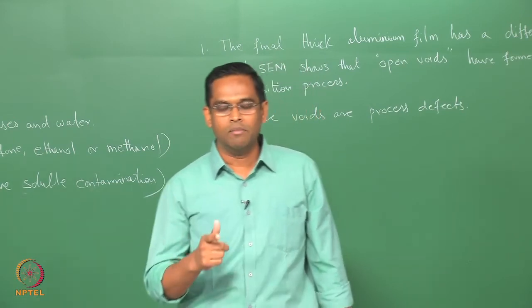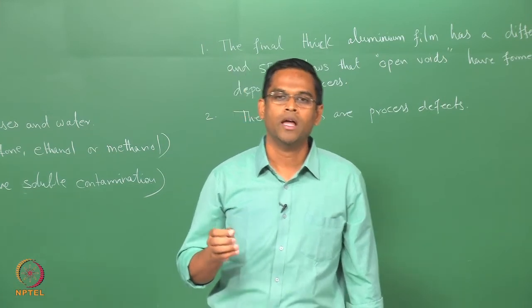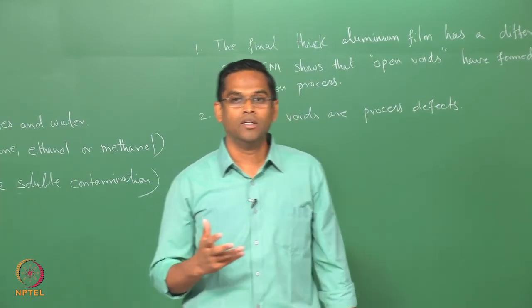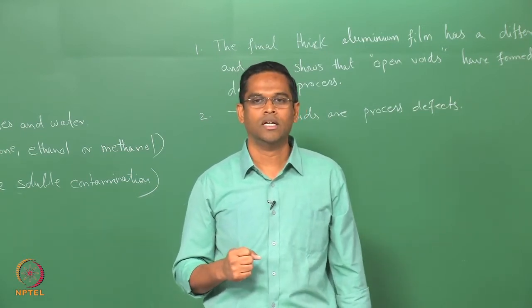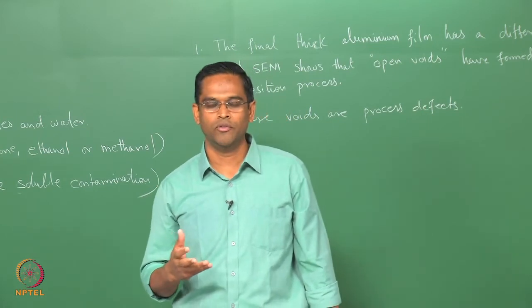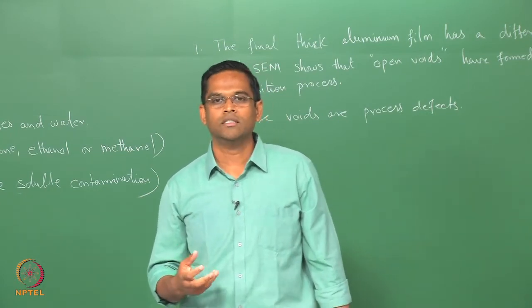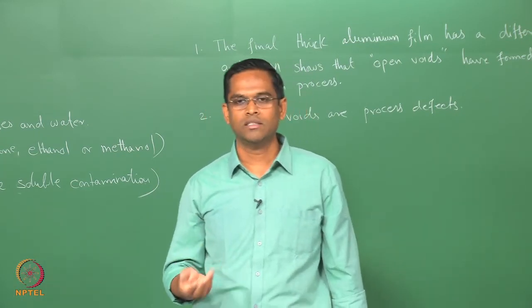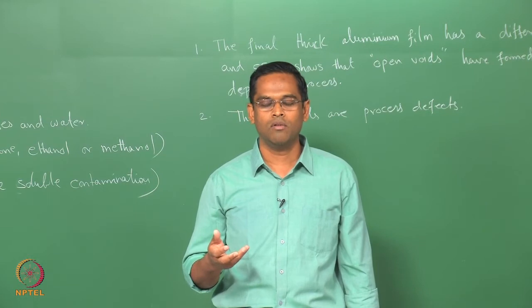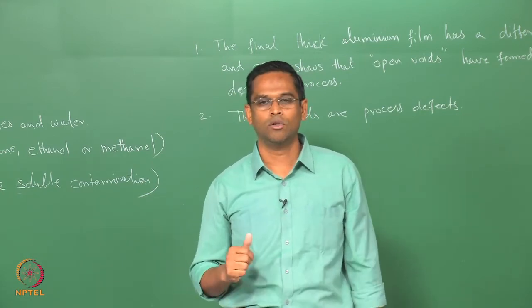Remember, as I mentioned in the theory class, the detection capability of an energy dispersive spectrometer is inferior to another similar technique called wavelength dispersive spectroscopy, where you can have much more resolution in the analysis. You can do a similar analysis if you have the attachment with an SEM. If you are interested in higher resolution microanalysis, it is always better to have a WDS rather than EDAX. But EDS has its own advantage in the sense that it is quite fast and you can quickly find out the result as compared to the WDS, which I have already shown in the theoretical analysis.